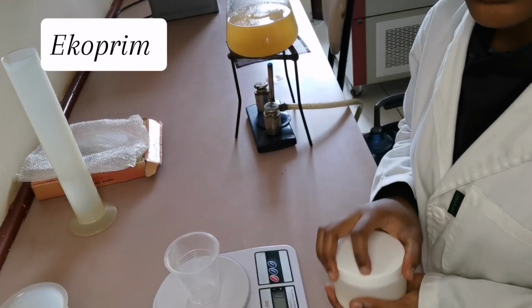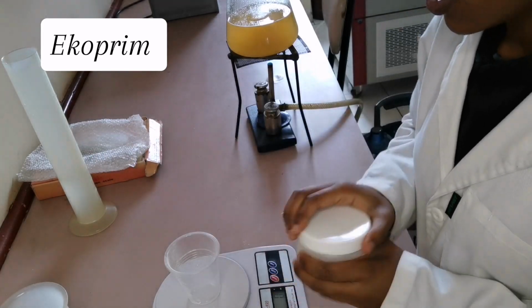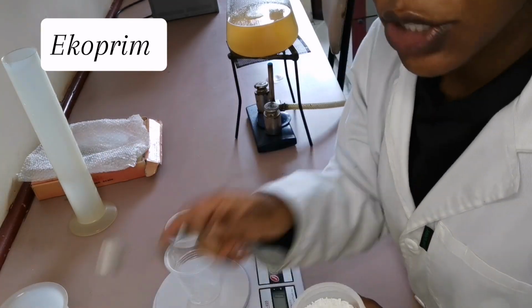Let's move on to the Ekoprim preparation. We're going to be using this Ekoprim powder, so we're going to be measuring 17 grams.